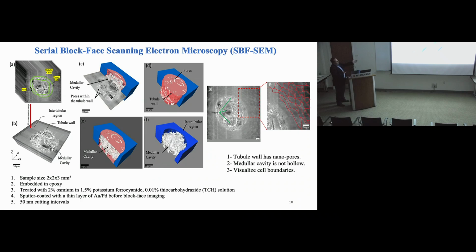So when we go for higher magnification, we started to see that, and we will see the effect of that later on. That is the good thing about this kind of instrument, that we were able to construct these images and get this new information. At the same time, you can see here in the upper right side, we can see clearly even the cell boundary, which is not easy to find with TEM because the sample in TEM is very tiny, and you cannot see it beautifully like that.